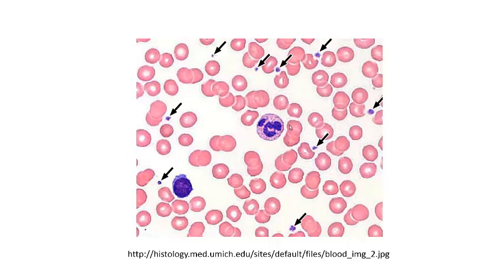We also see a neutrophil in this slide. The neutrophils have segmented nuclei, so this is a very typical neutrophil, and it takes up red and blue stains equally, so it might have a very light purple lilac cytoplasm that you see here.